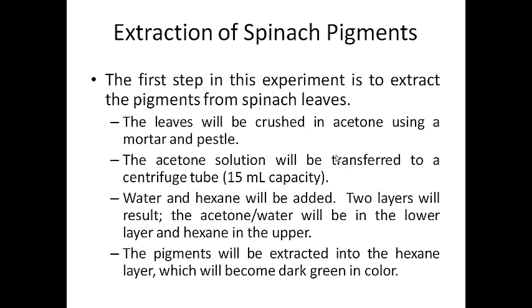You're going to be doing this experiment in groups of 2 or 3 because it's easier that way and it'll save on resources. So the first step is we have to extract the pigments from the spinach leaves, and I have photos to show you exactly what you're going to do.